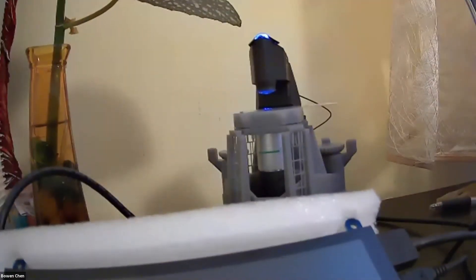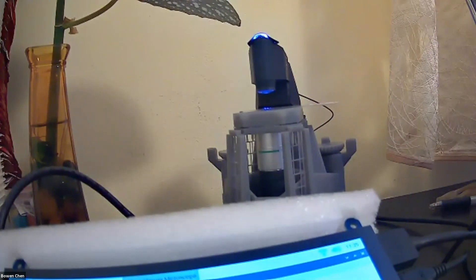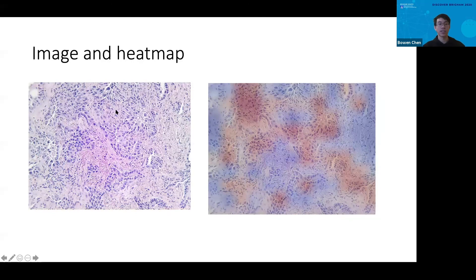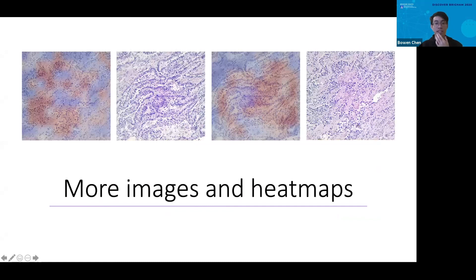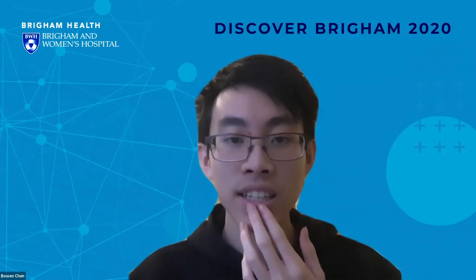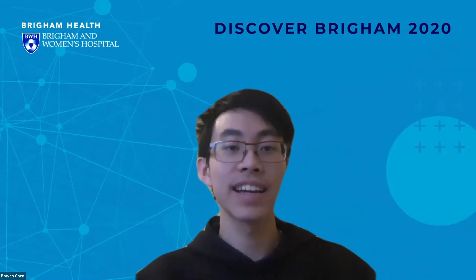The webcam doesn't show the screen very well, which is why I took some images beforehand and fed them to the model. Here is an example image taken from the microscope on the left, and the resulting heat map generated after being run through our model using the Jetson Nano on the right. You can see the heat map shows the relevant regions attended to by the model. Here are some more images as well.